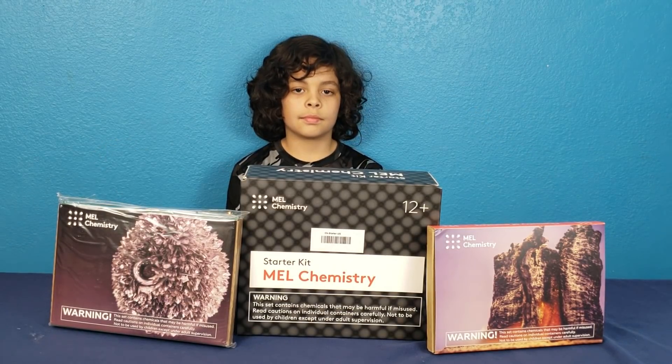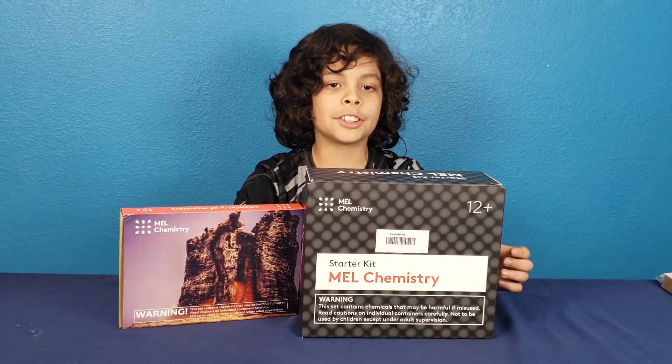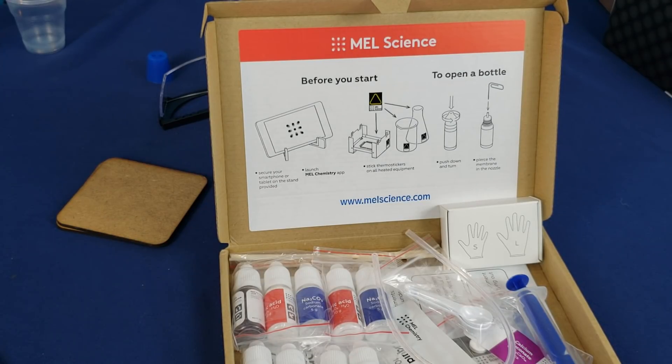All the equipment is included and a mobile app assistant for Android and iPhone are free! Okay, let's open up the starter pack and see what's inside, because today we're doing the chemistry of monsters kit! So we open the kit and we try to find all the stuff that it calls for — look how easy it is. There are pictures, so even I could get it right.